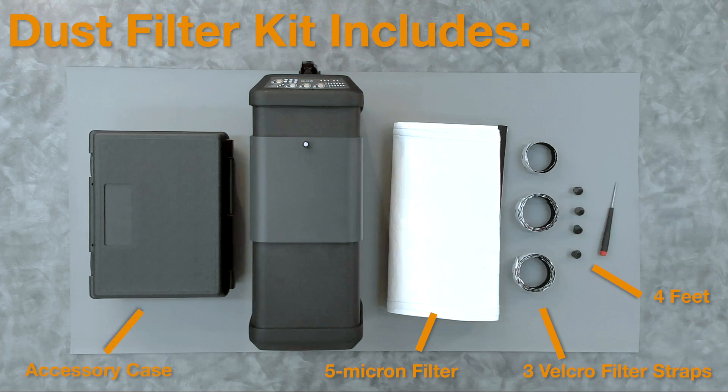As the accessory drawer will be covered by the filter, a separate case is provided to protect the calibration media and aperture plates.